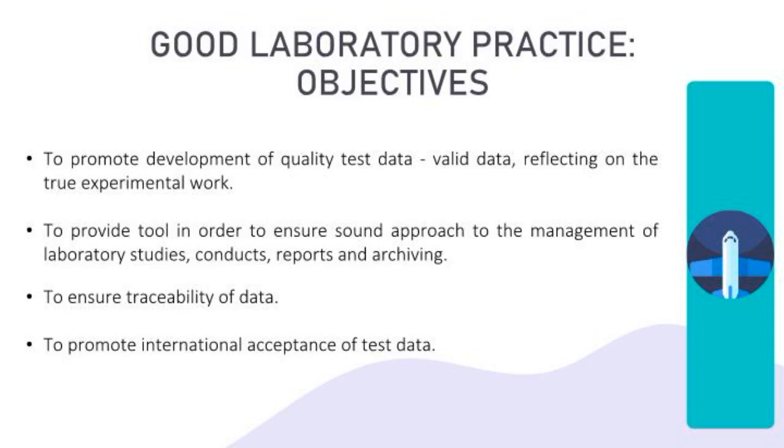To provide an outline or a tool to ensure a sound approach to the management of lab studies, their conduct, reports and archiving. The GLP also ensures the traceability of data. We want all the analytical data obtained to be tracked back to its original source of sample or specimen. And lastly, the GLP is to promote international acceptance of data among the participating countries.